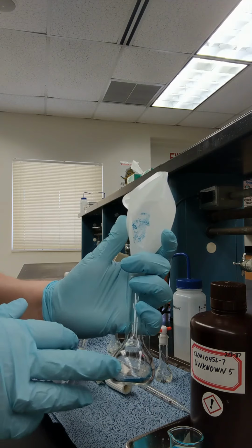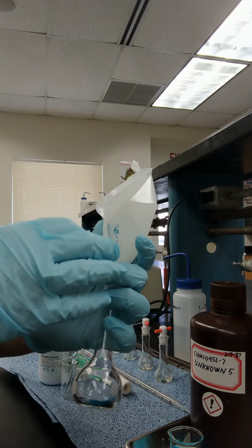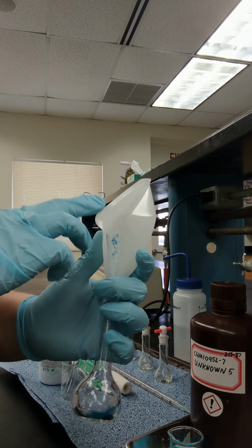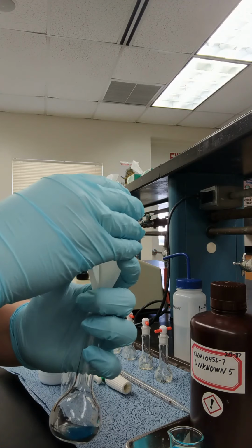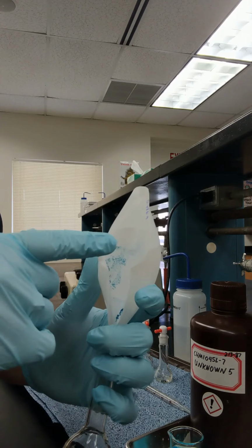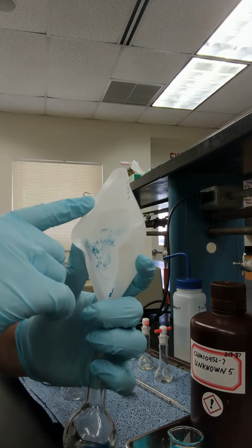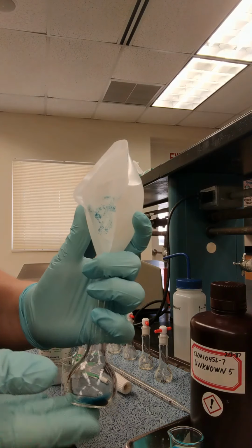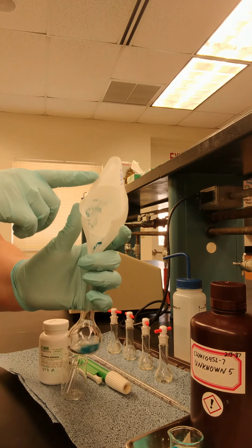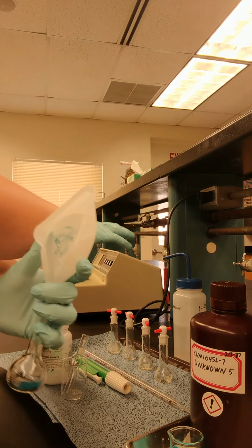So the first thing is to prepare the stock solution. You see I'm folding my plastic weighing boat. If you're using a weighing paper, it's easier, but I have this one here with my solid sample. So I folded it and I transfer my solid in here. There's always some solid that gets attached to the plastic boat that I'm using. So we're dissolving this using distilled water. I'm going to rinse that amount of solid, making sure that everything goes in the volumetric flask.